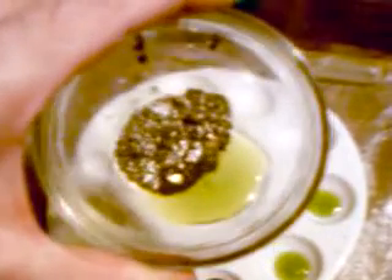Here it is in the glass dish. You can see it against the white background — it is quite green. I have never seen aqua regia turn green on an ore before, but it surely did on this one.